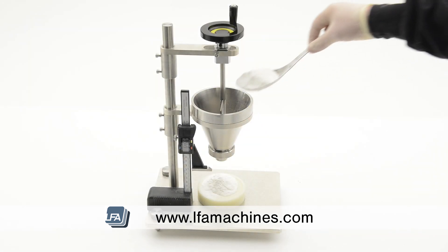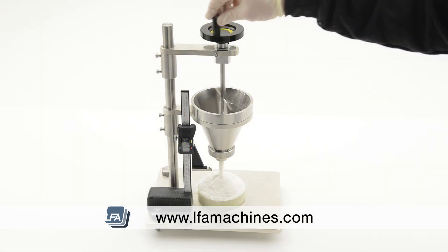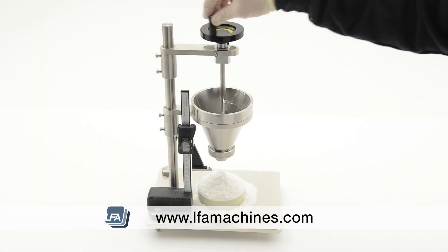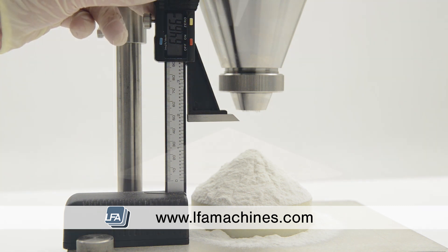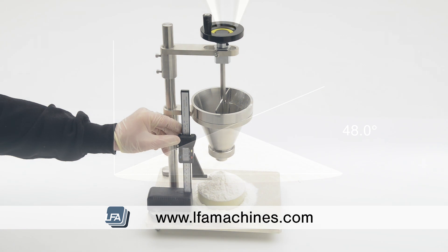The test is simple: by pouring your powder through the funnel, stirring if necessary, this will produce a cone on the test platform. By measuring the height of the powder cone produced, we can calculate the angle of repose of your powder, working out how well the powder will flow through your machine.